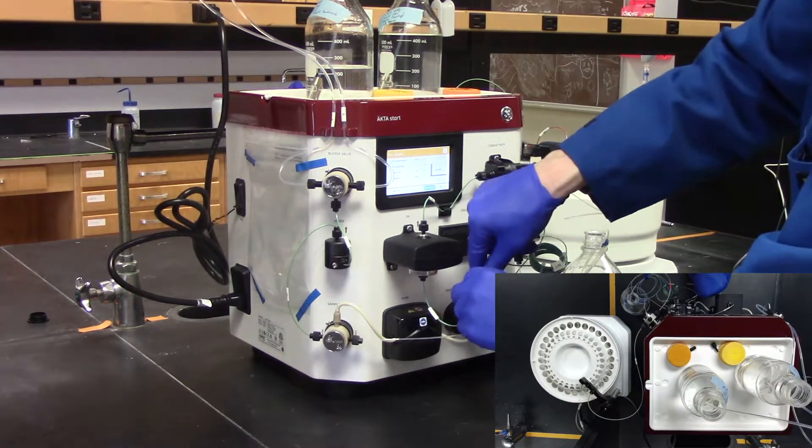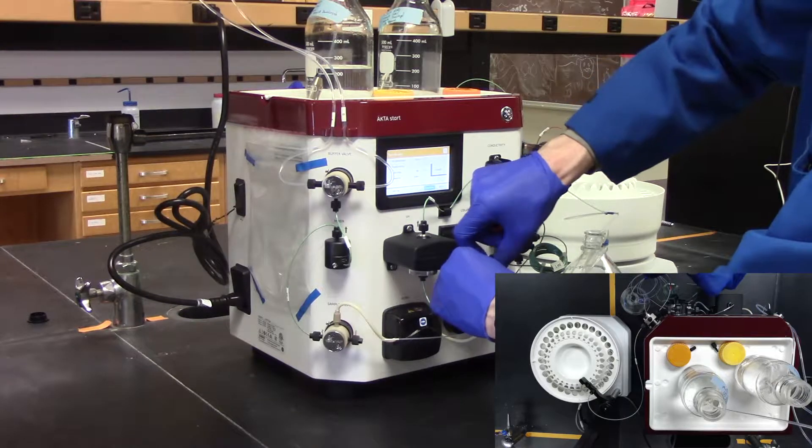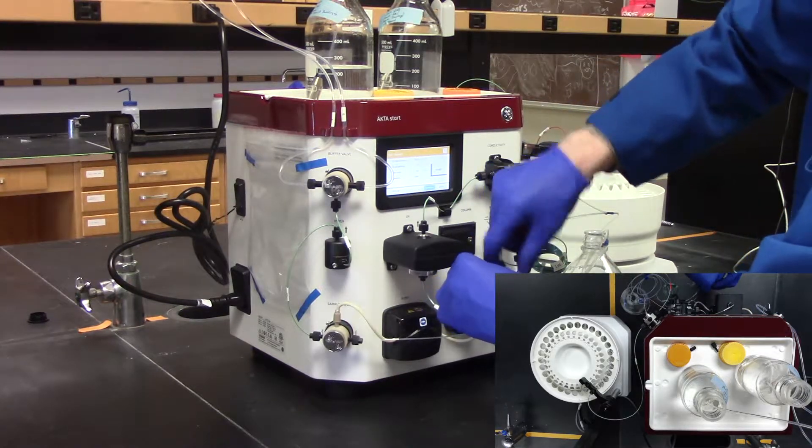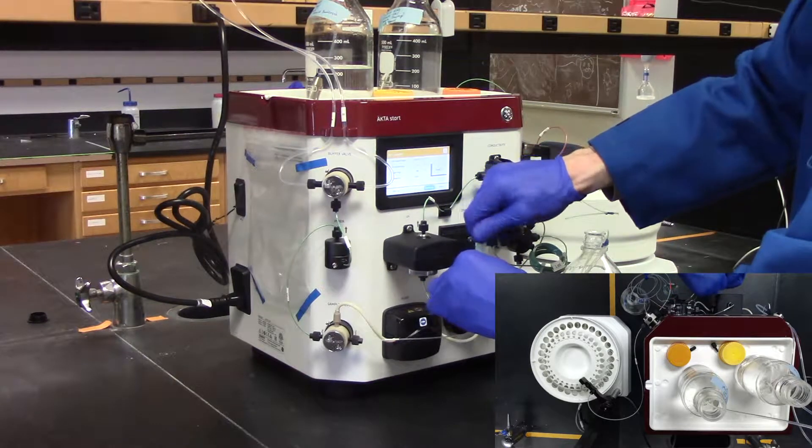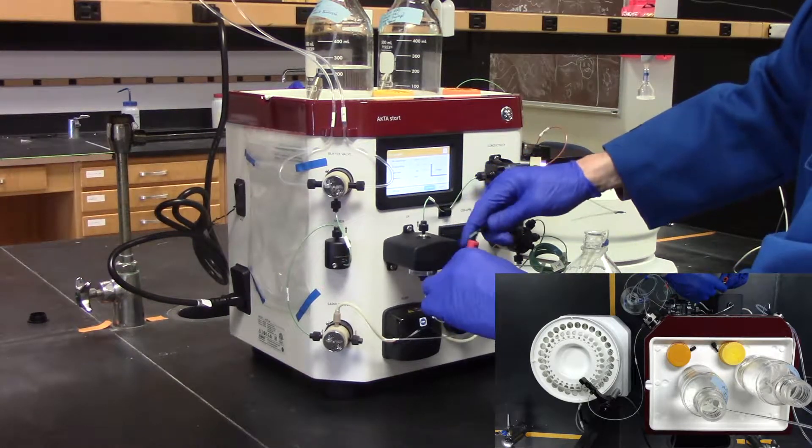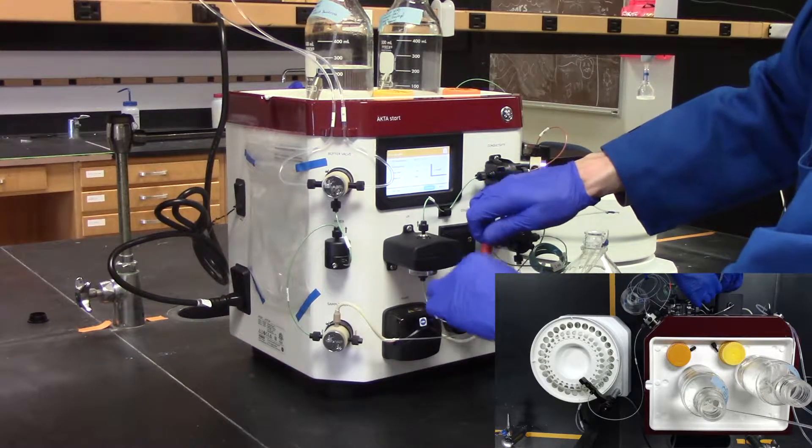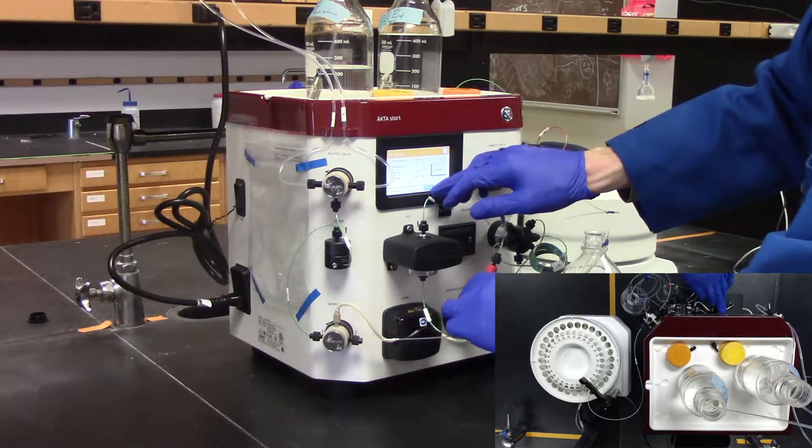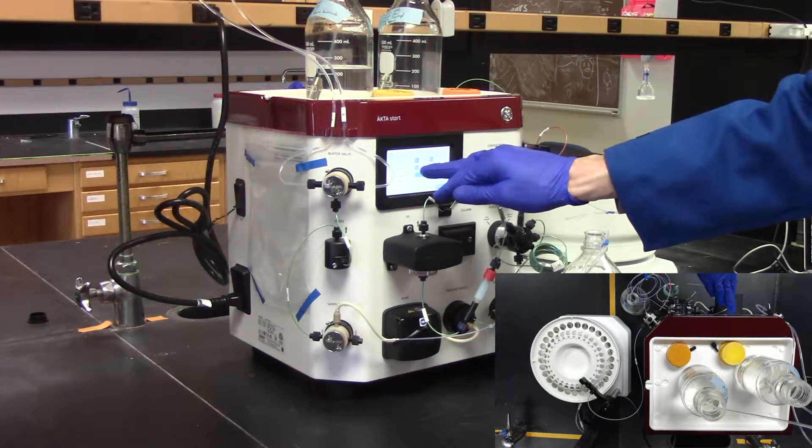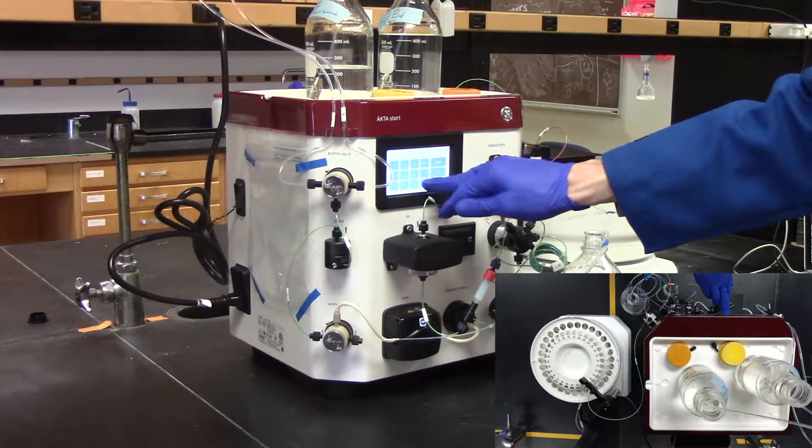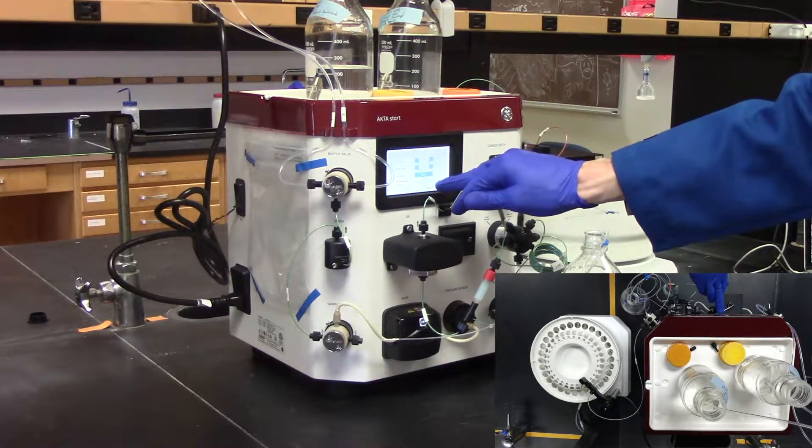Next, we need to add your His column to the FPLC. Unscrew the coupling on the His column before the UV detector. Insert your FPLC column on the coupling and on the line. Change the flow of the FPLC so that the buffer flows through the column. Reduce the flow rate to 1 mls per minute for our 1 mL His column, or up to 5 mls per minute for our 5 mL His column.